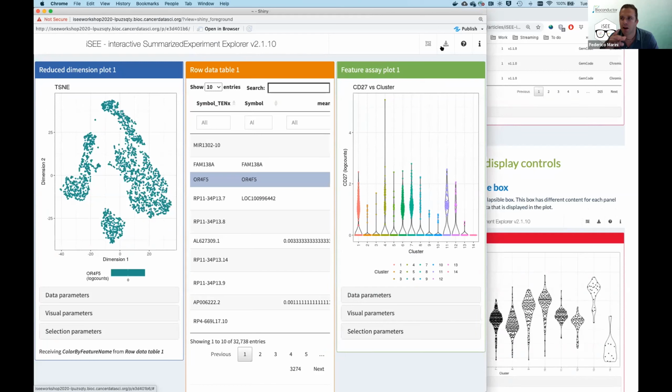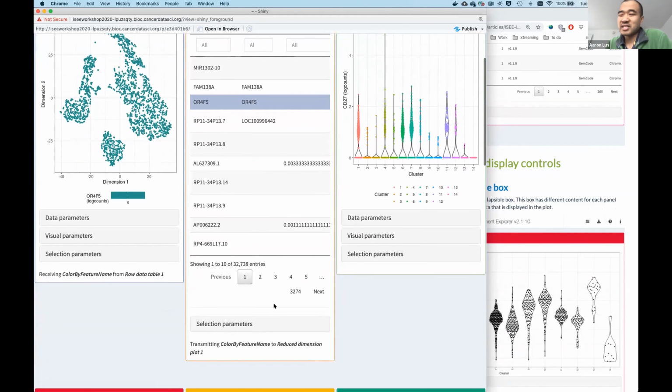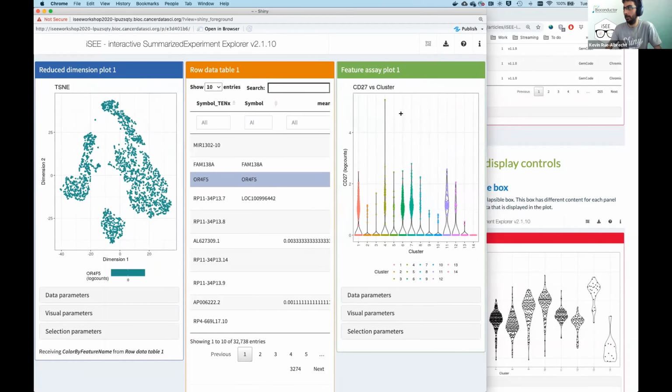Nested data frames are handled in a way that they just get flattened out, so all the components of the list or of that data frame would ideally show up. That used to be the previous behavior, but in the latest version, that's no longer the case, I believe, just to keep things simple. We had it at some point, but I've seen it disappear in recent updates.